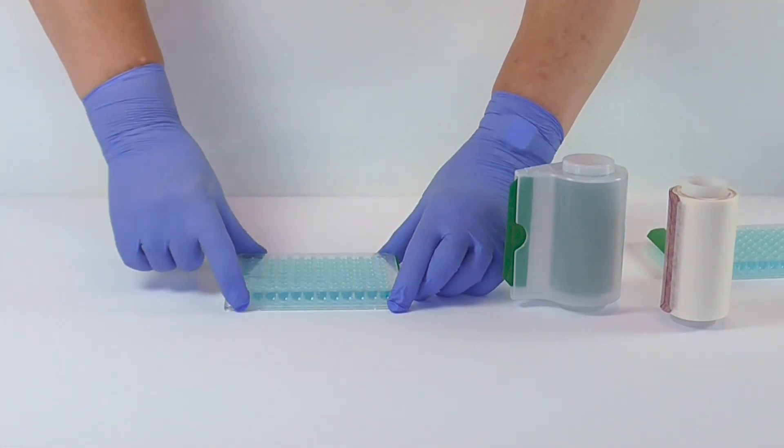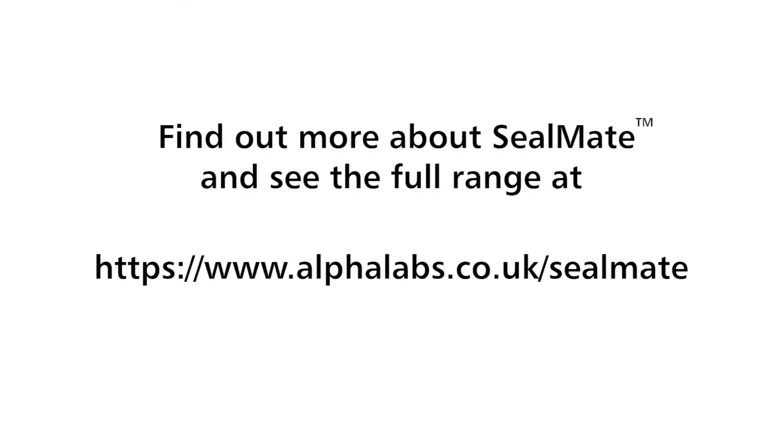SealMate provides quick and easy convenient sealing for your microplates.